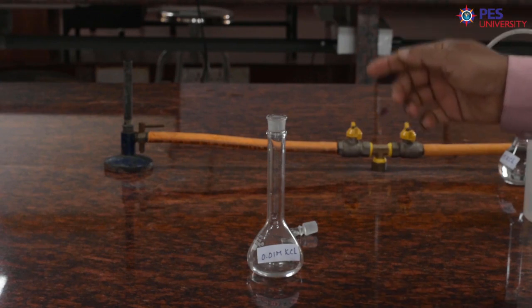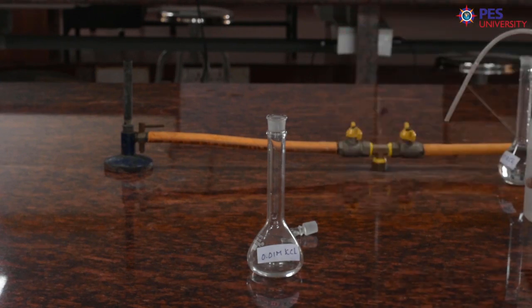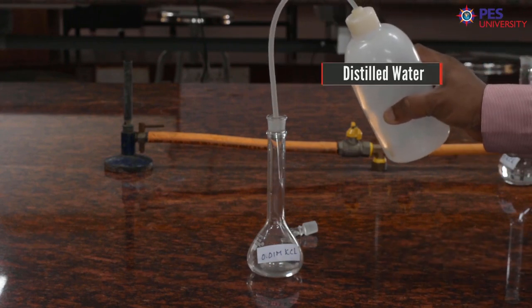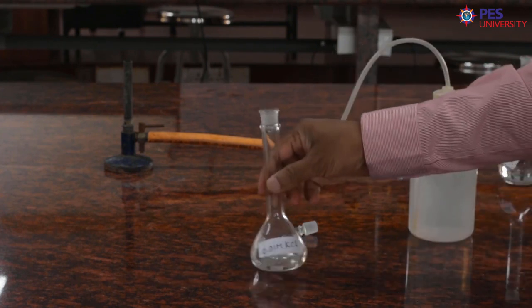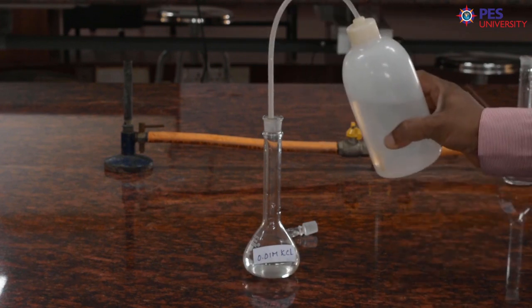After transferring 10 ml of 0.1 molar solution into the 100 ml volumetric flask, add distilled water to the flask. Then swirl the flask. Again add one more portion of distilled water.